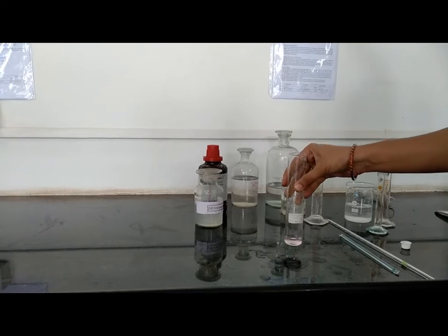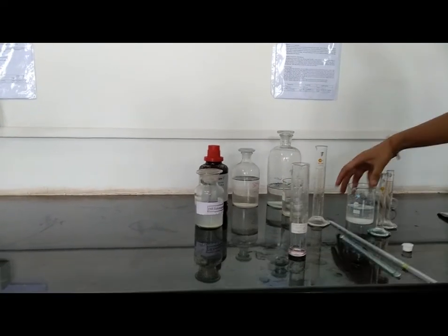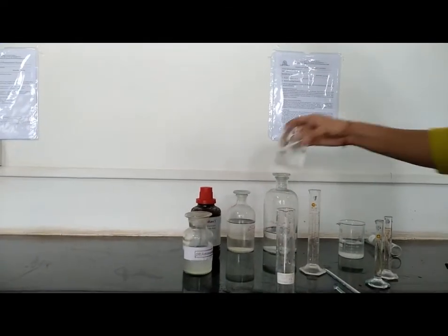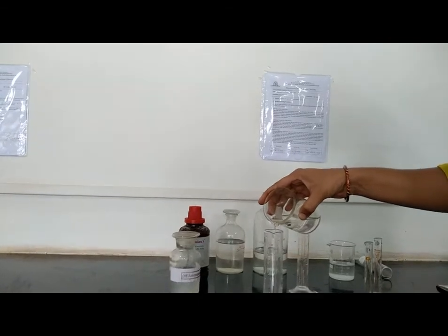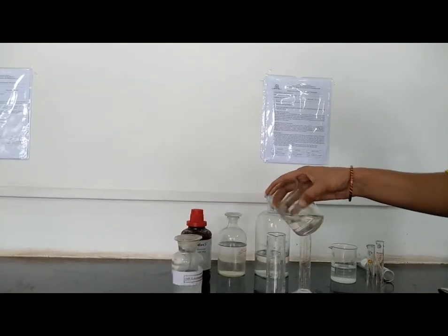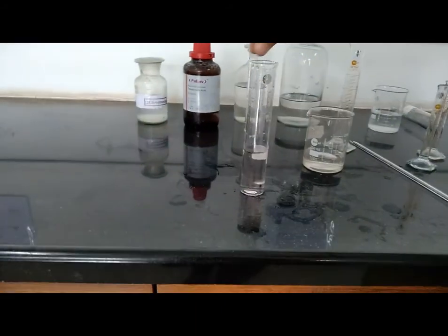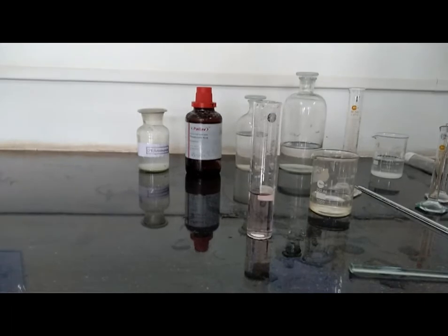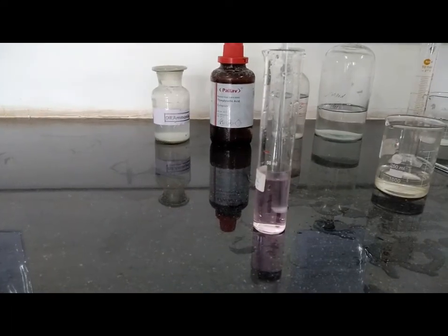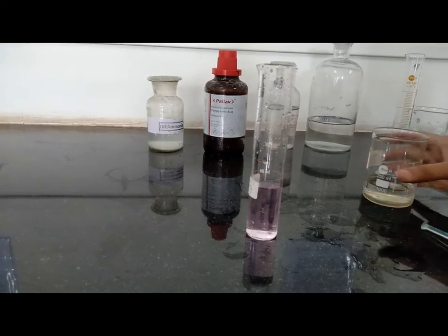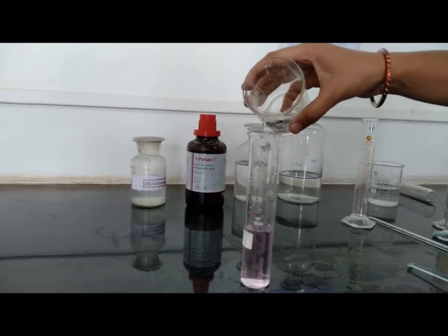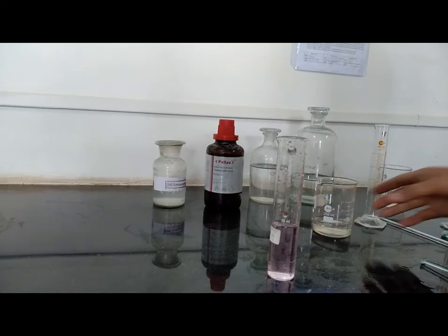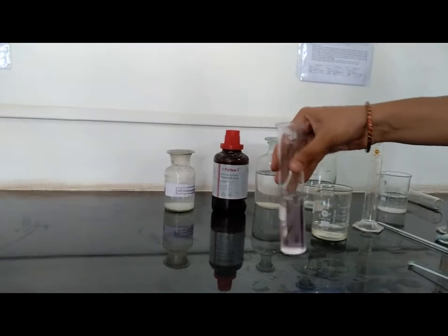And make this solution slightly alkaline with the help of dilute ammonia. Again dilute this solution, then add up to 50 ml with distilled water. After stirring we have to adjust. Now keep this solution aside for 5 minutes.